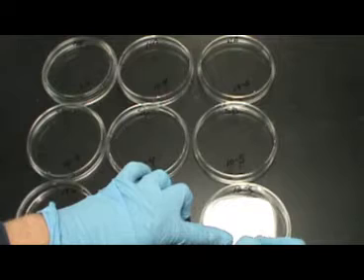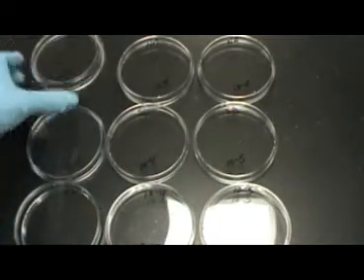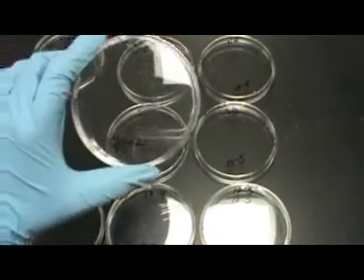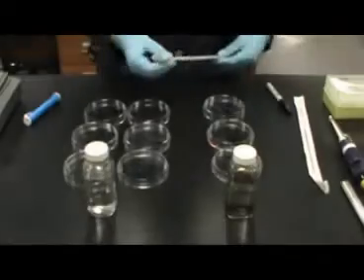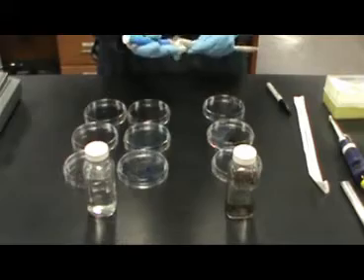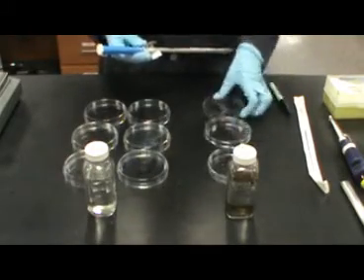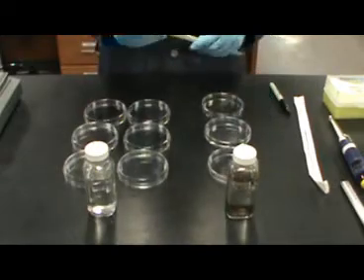Be sure to label your plates on the bottom and on the edges so as not to obscure your view of any of the samples that you will be viewing. Now, begin turning your plates over in preparation for adding your samples and pouring agar. To add the samples, you will need both a serological pipette and a micropipette. Carefully flip the plates over so you can easily pick up the lid.